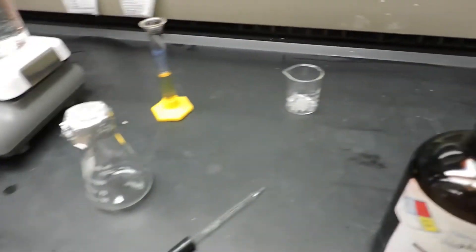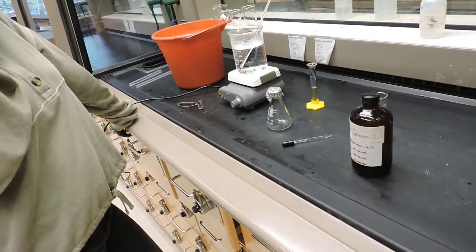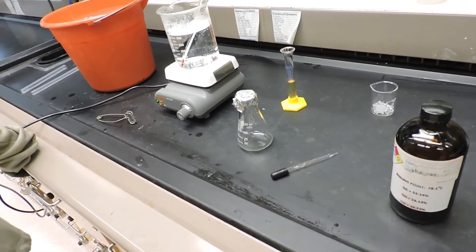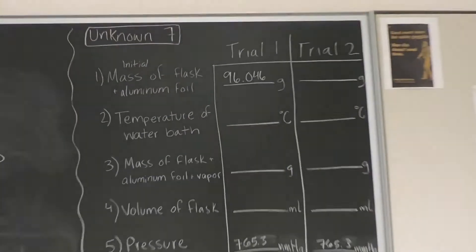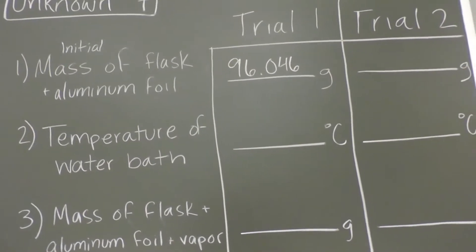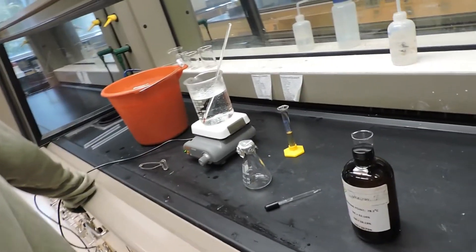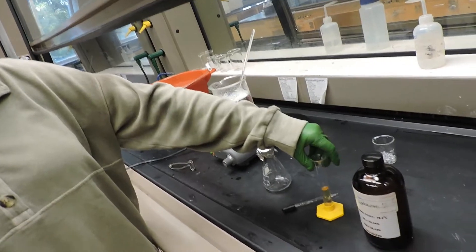The first thing we're going to do is find the combined total mass of this Erlenmeyer flask with the piece of aluminum foil and record that mass, which we have done up here for the first trial. The mass of the flask and aluminum foil is 96.046 grams.